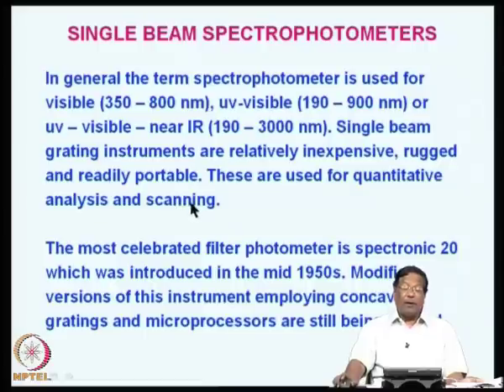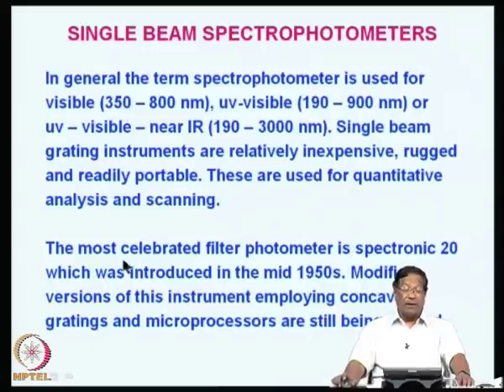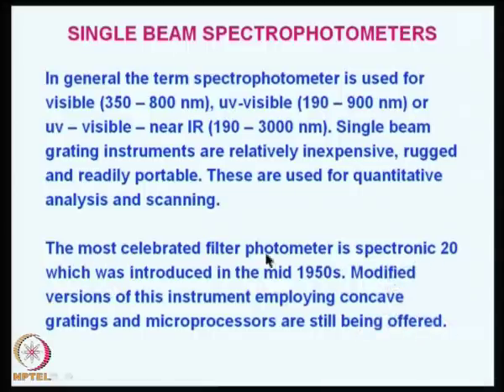That means, with the microprocessors, you can scan the spectrum right from 190 to 900 nanometers, or even near IR in the case of plastics and other related materials. The most celebrated filter photometer is Spectronic 20, the model which was introduced in the mid 1950s. During that time, most of the research in analytical science was being carried out only by this Spectronic 20, and it is supposed to be one of the most rugged instruments.